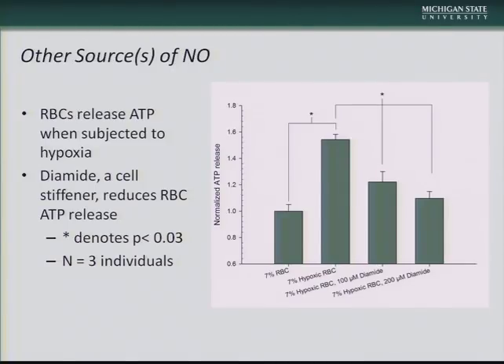And so I wanted to keep using our devices to learn more about the nitric oxide that was actually above that endothelial layer in our device, meaning the NO that would participate in the vessel relaxation. One of the things we did is we also used our device to look at how much ATP was released from these red blood cells when subjected to hypoxia. Because again, remember, this is going to set up a future slide where we're looking at how much nitric oxide was stimulated by the ATP.